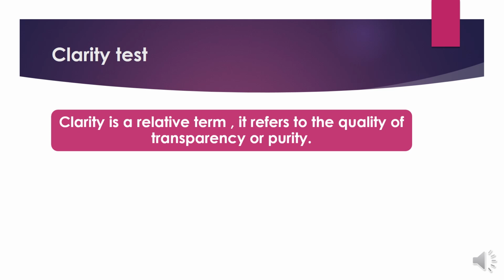Means when any product is transparent or clear, it shows that it is of high quality or it is a pure product that is free from any sort of contamination or any particles. So any undesirable, undissolved particles are not available in the particular product. That shows its high quality or purity.